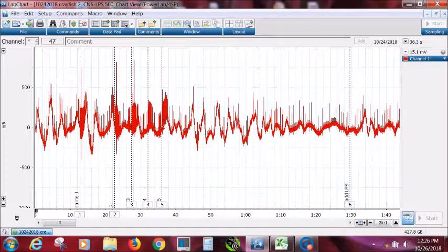What we're going to do is measure the frequency of activity in each one of these runs, and then average that activity, because there's some variation with each of the brushes. This will help us get an average value for the brushing. You also see there's some baseline activity. Notice the baseline here wiggles up and down, and then you have spike activity on top of that.